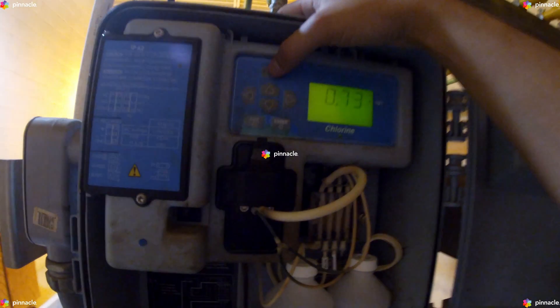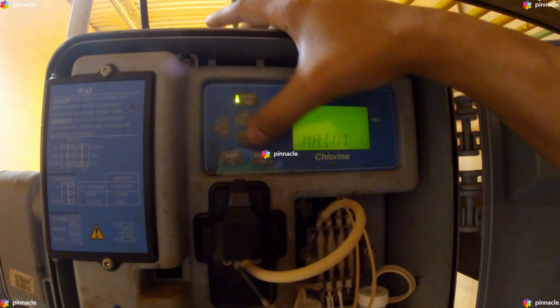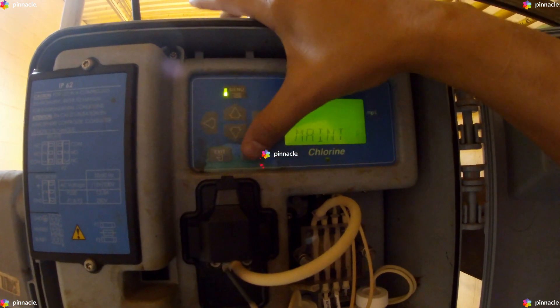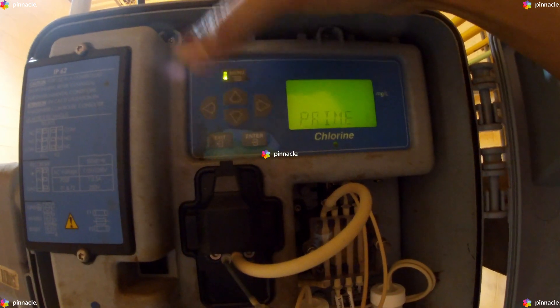We will begin by clicking on the menu. Scroll down to Maintenance, Enter. Scroll to Prime, Enter.